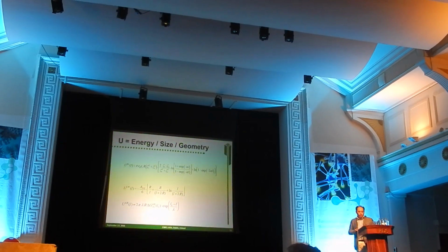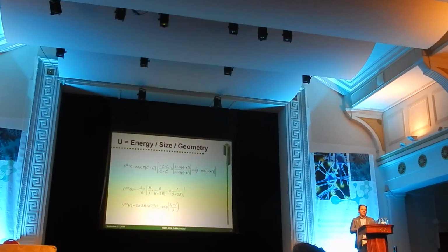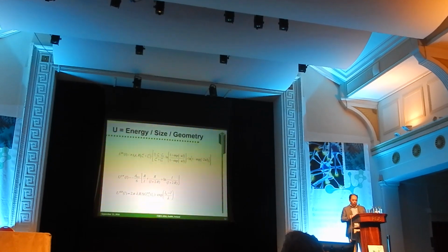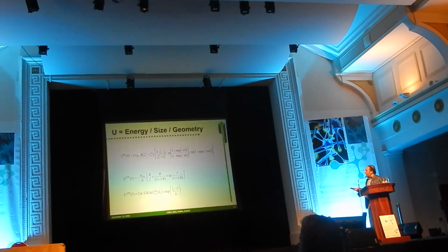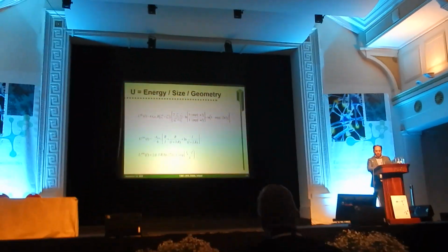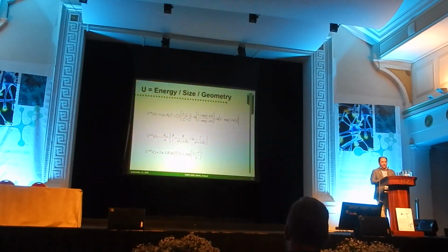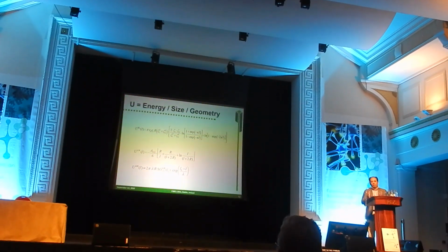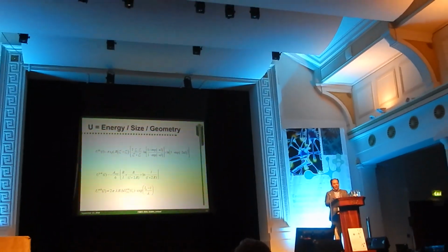And then the next question is how you actually use the information that you get from contact angles and from zeta potentials. Well, you basically use a set of equations, to make it very simple. These equations are going to calculate the potential energy of interaction here. This is important because the equations for the calculation of the delta G's that I showed before give energies calculated between basically 2 planar infinite surfaces per unit area or so.